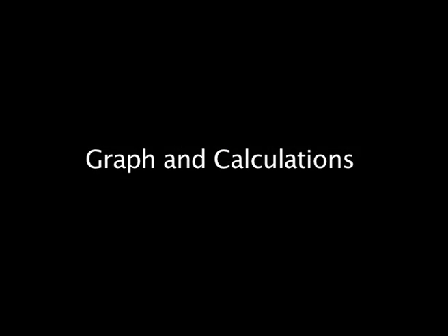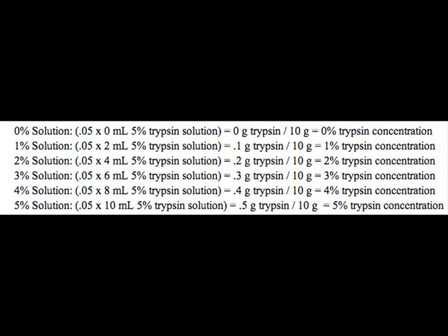During the course of the experiment, calculations were done to determine how much trypsin needed to be in each solution. For the 0% solution, 0 grams per 10 grams of solution was needed.